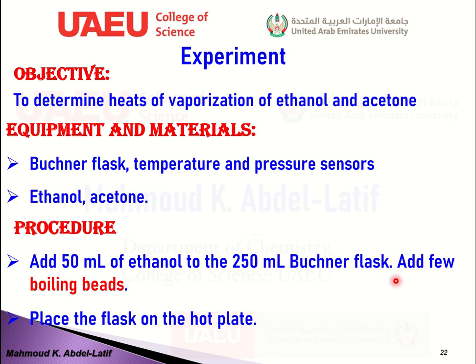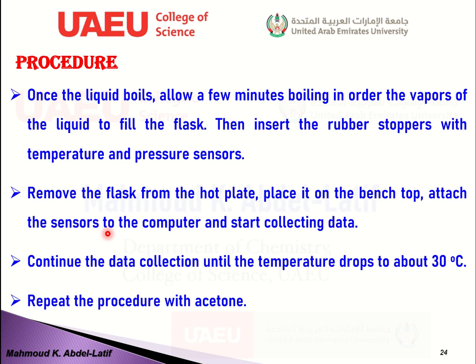flask, and add some boiling beads, which prevent strong boiling of the solvent. Just place the flask on the hot plate, and once the liquid boils, allow a few minutes of boiling in order for the vapors of the liquid to fill the flask.